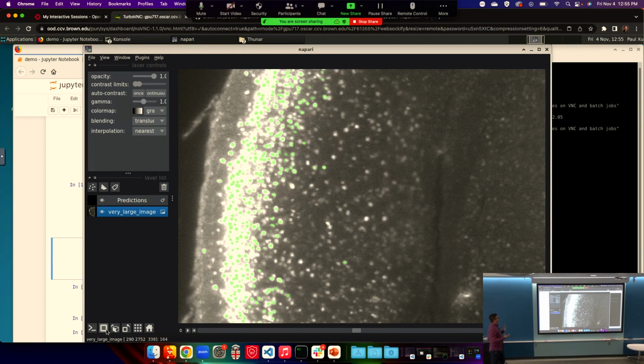I think there is a way to save downsampled images of the original, so that it works like Google Maps. At different scales, it loads different arrays, so that you can do the 3D view with a lower resolution image if you view it from a distance.